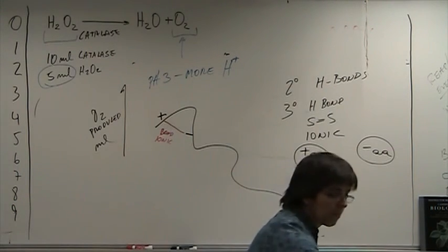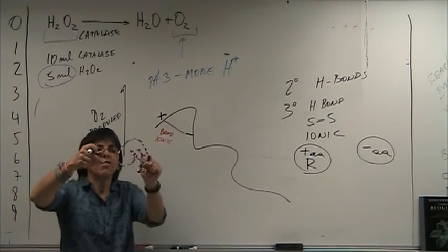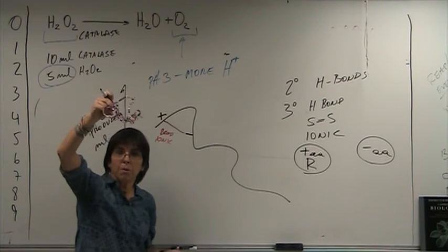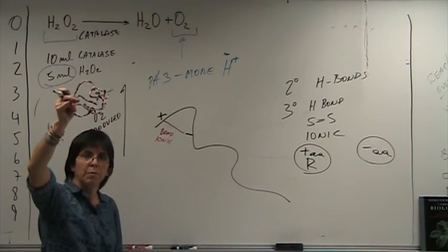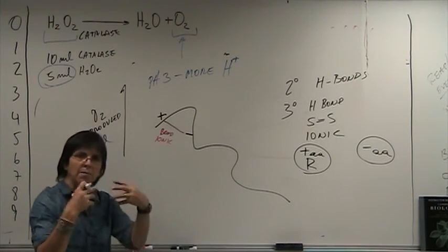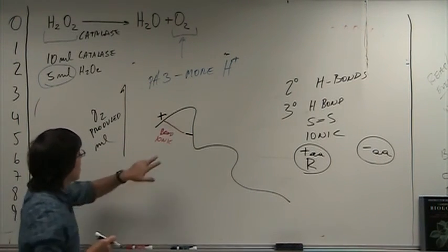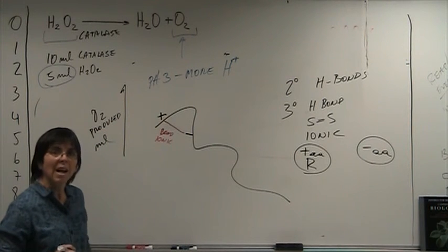Now, when a protein has a particular shape, all these shapes are functional at usually the pH that is supposed to be. Normally between 6 and 8, they hold their shapes pretty well because that's the normal condition in the cell. Their interactions are balanced by the amount of hydrogen ions at that pH. Now, if I do pH 3, I'm going to add more hydrogen ions.